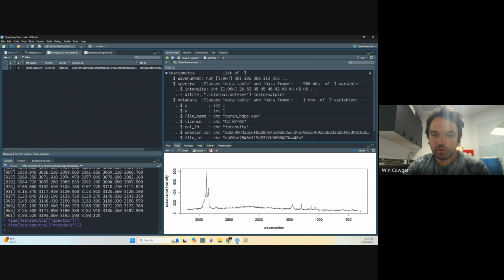So these are coordinates. In this hyperspectral image that we talked about during some of the previous sessions, you have a coordinate system of where the spectra are located. So these are the XY coordinates of where they would be located. Since we just have one spectrum, or if you had a bunch of spectra that didn't have XY, it's going to still give them XY because that'll allow us to project our data into something like an image, even if it doesn't have a coordinate system.